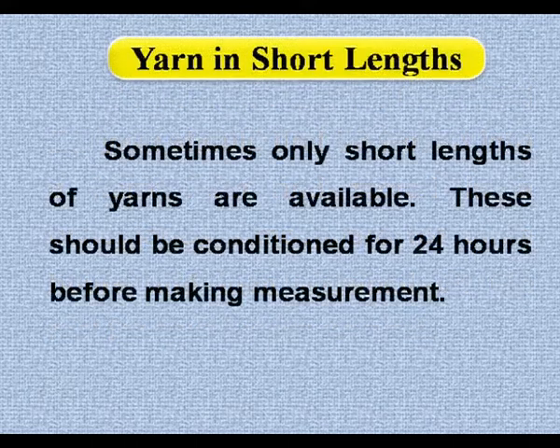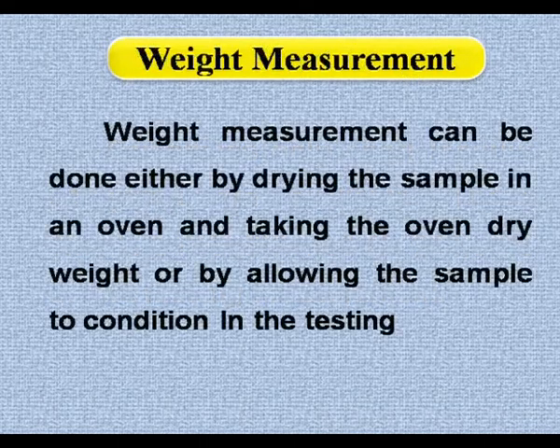Yarn in short lengths. Sometimes only short lengths of yarns are available. These should be conditioned for 24 hours before making measurement. Weight measurement.